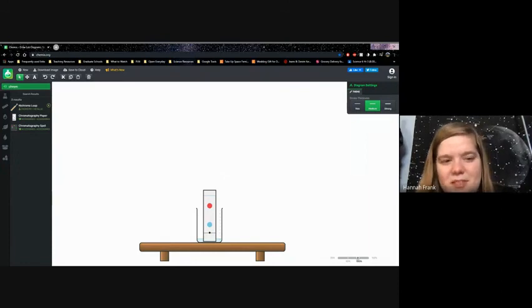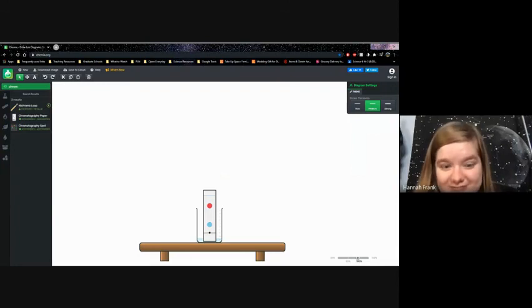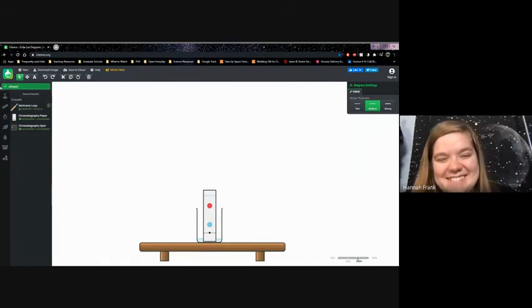And then what's the last part that we always put on top? Towards the W. Rhymes with schmotch glass. Watch glass. There we go.